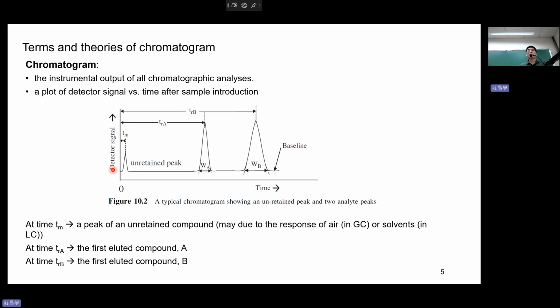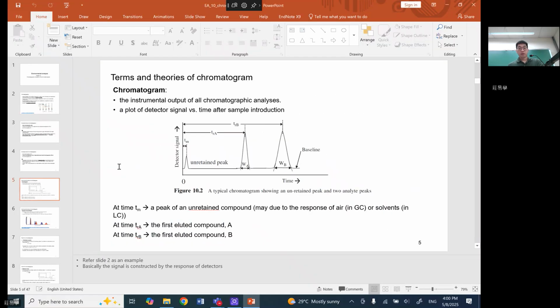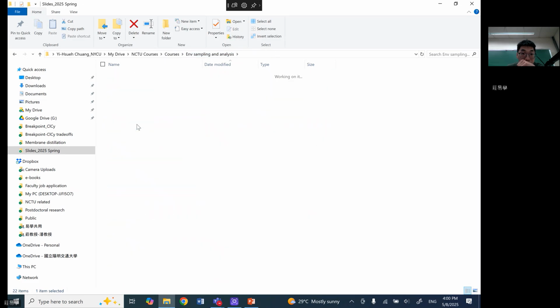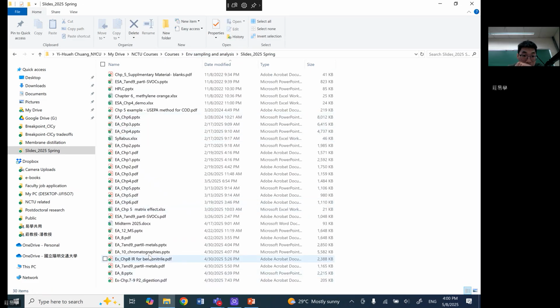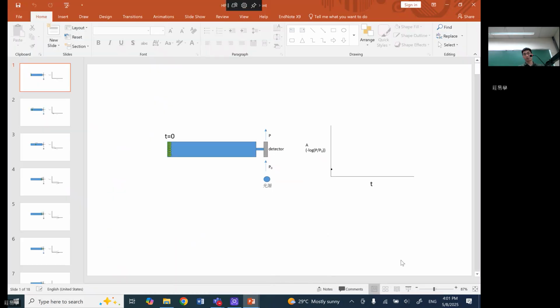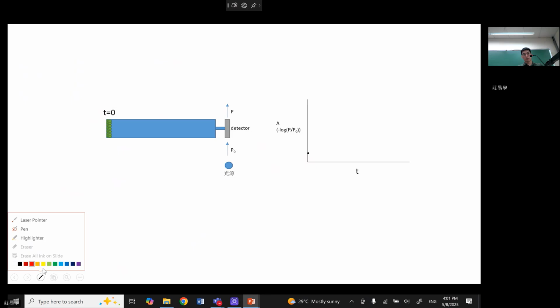And let's use HPLC as an example. Right, so let's look at this animation.